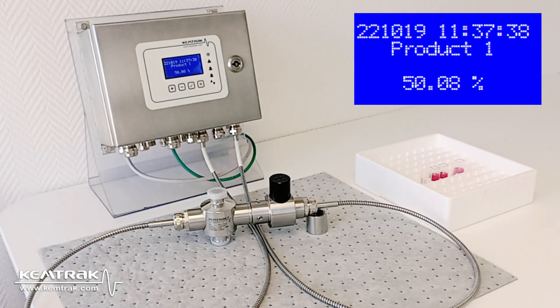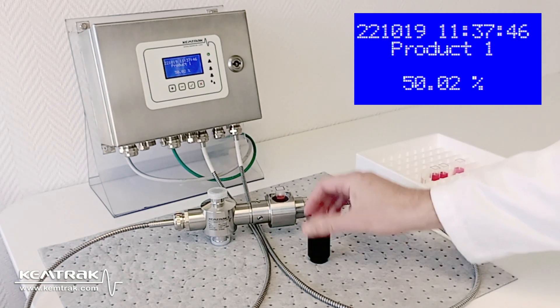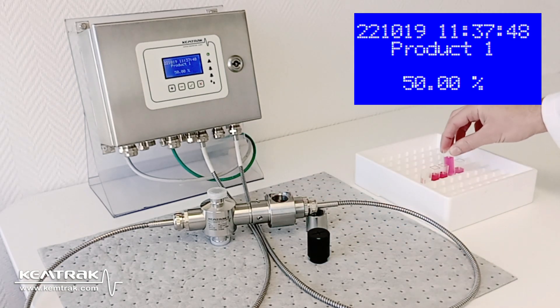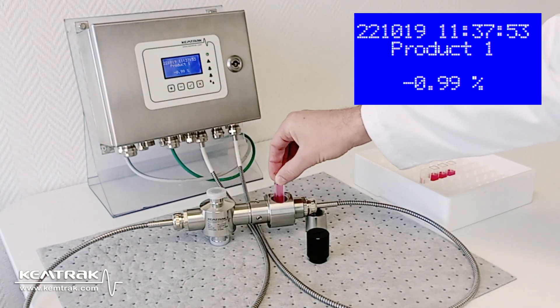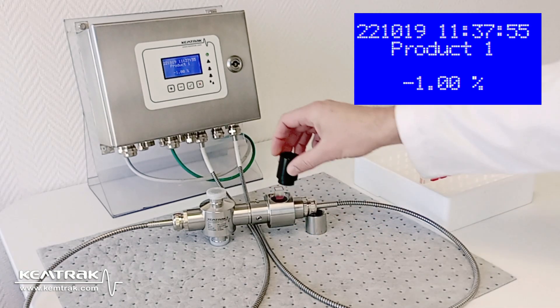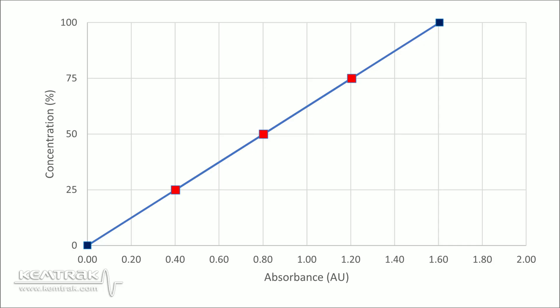Notice that I'm using a calibration and validation accessory, which allows me to avoid contaminating the measurement cell when I calibrate or validate. And finally, the solution at 25%. During this validation, I can verify that the concentrations of my samples are on the calibration curve.